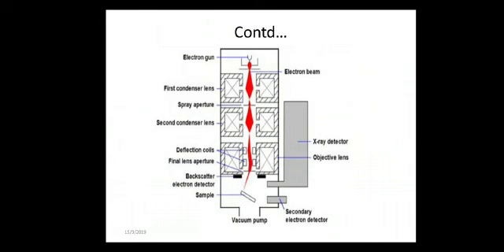Yes, there are some advantages of the scanning electron microscope. As I said, when compared to optical microscopy, we are able to magnify to a higher resolution and we can get clear images. This is the first advantage compared to the previous instrument. The next one is that it is easy to operate with proper training and advanced computer software to make the operation user friendly.